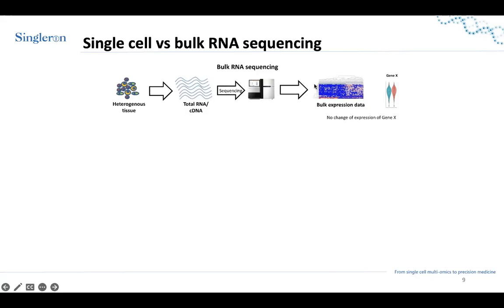So you have basically a certain set of genes in the columns, for example, and the different samples in the rows. And for each sample, we have the gene expression level. Based on that, you can take, for example, a gene X in the column, whatever it is, and compare sample 1 and sample 2.